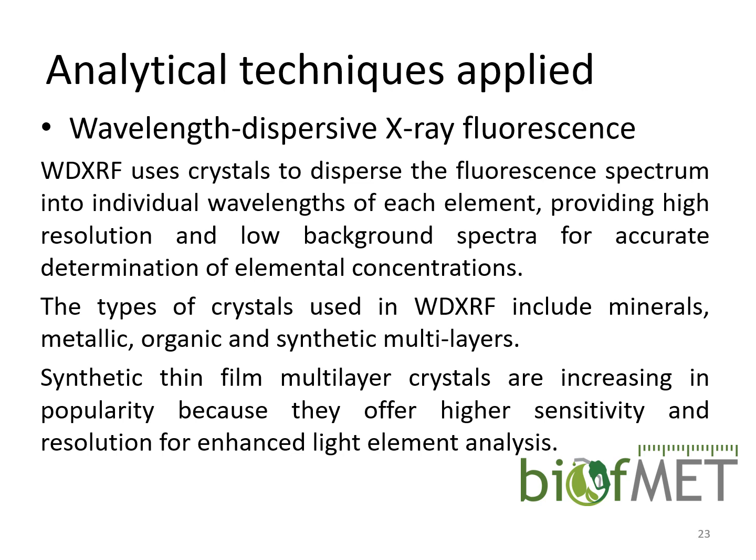In the field, you will usually find energy dispersive XRFs, but they are closely related, so you can use the same types of calibration standards and so on to calibrate such techniques. Laboratories dealing with, for example, geological samples or elemental analysis in different types of samples usually have both of these techniques, and they can compare the results.